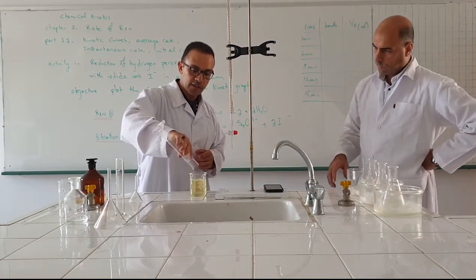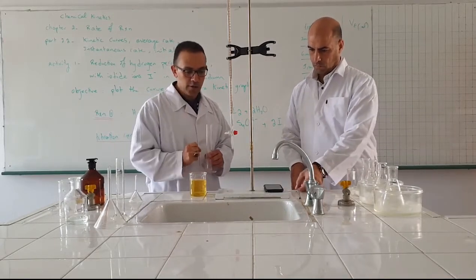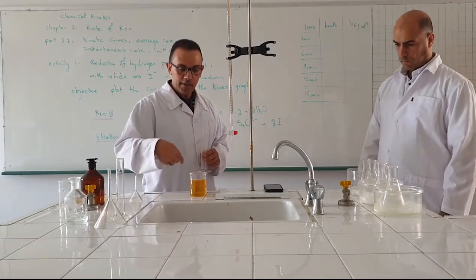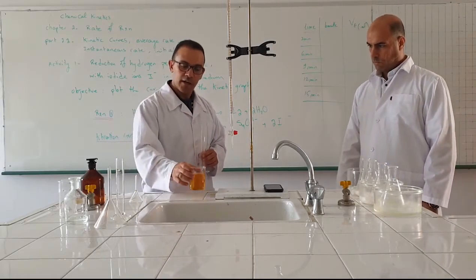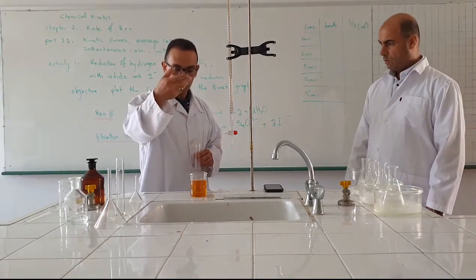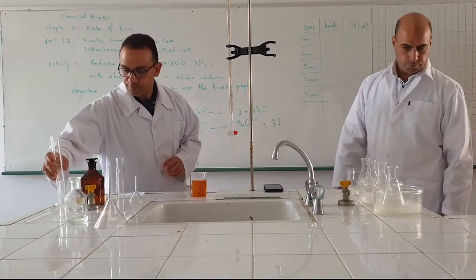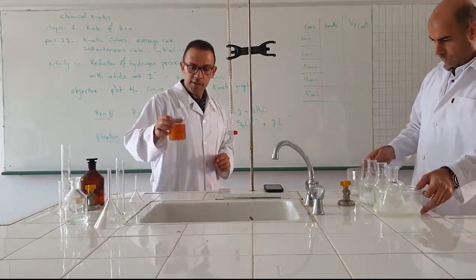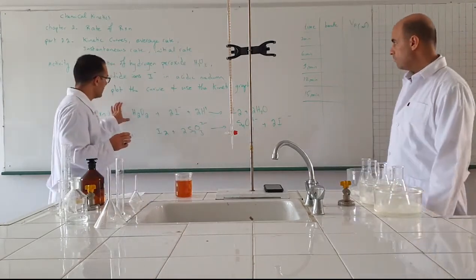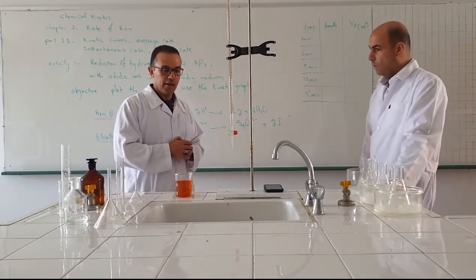The reaction starts. Observe that the color immediately turns yellowish, meaning that iodine is produced. Color is becoming more intense, turns to yellow, more yellow, orange color again, and again with the formation of iodine. This is the reaction mixture where reaction 1 is occurring.